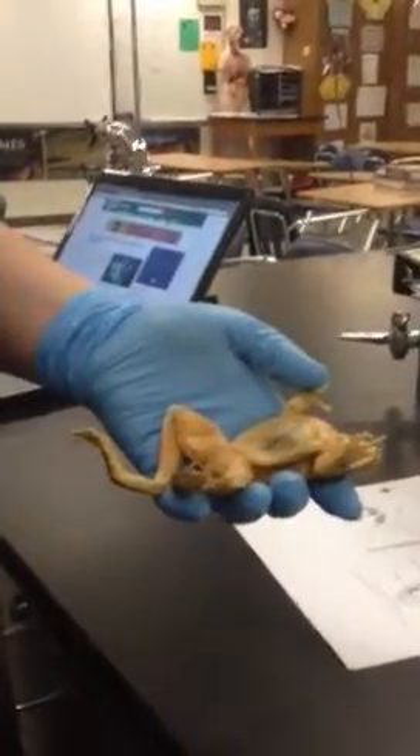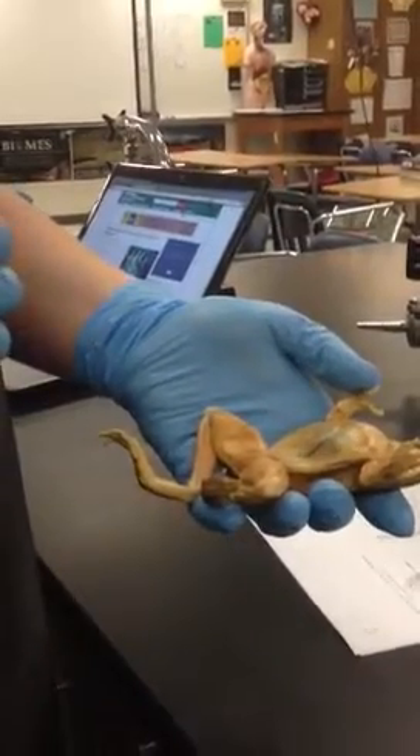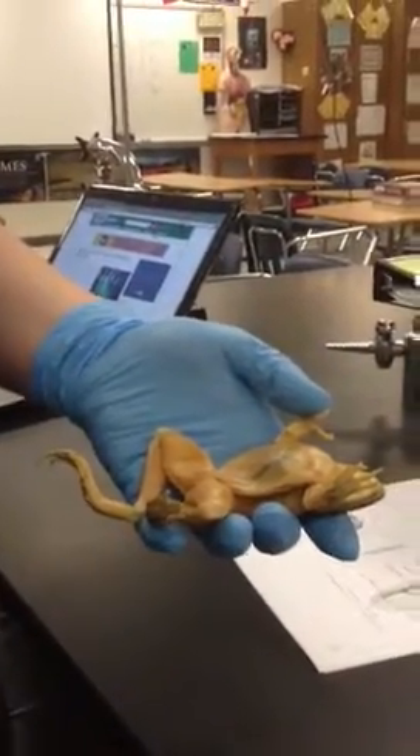Hi, this is Casey and Becca here with Dexter, who is a male frog that is approximately 10 centimeters long. Today is frog dissection day two, and we are going to discuss the muscles of the frog.